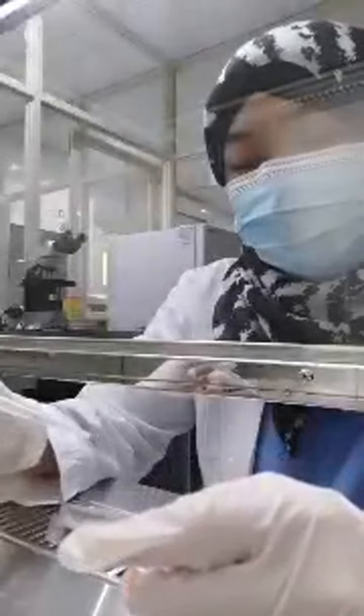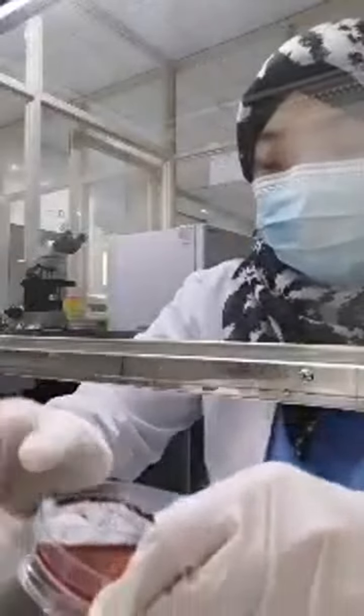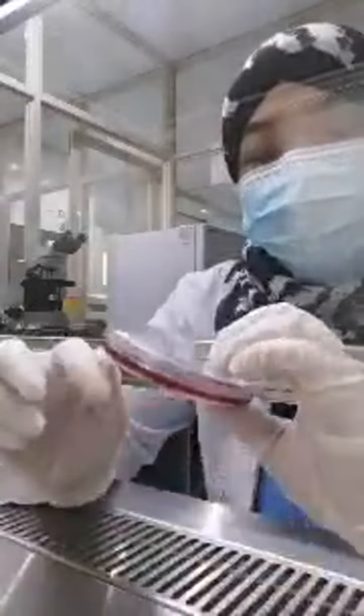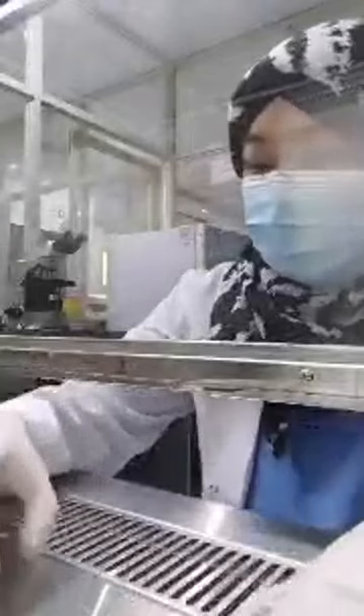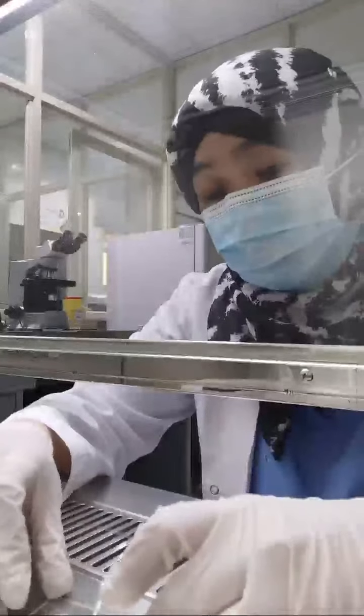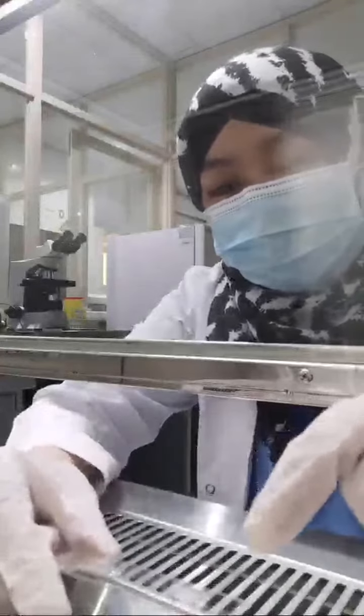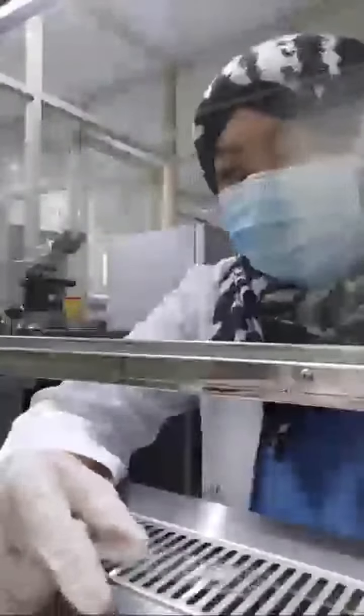It's not forming bubbles because it's so big. There is a mixed growth of staph and Candida. So I will get this yellow colony on the slide. You will see the other one without the bubbles. Wait, I will show it in the microscope.